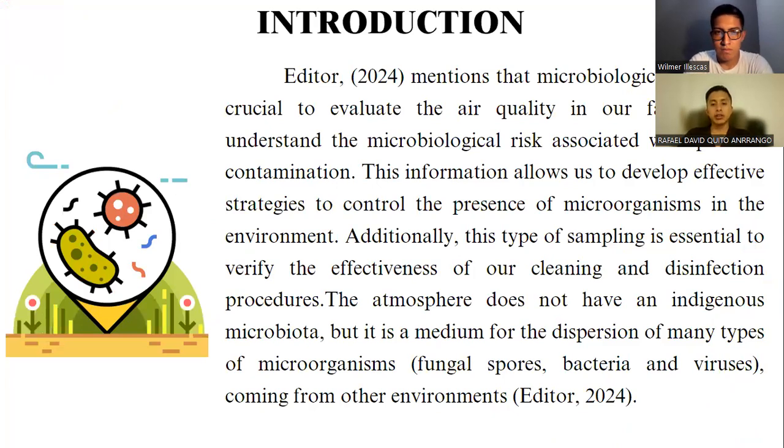In the introduction, Editor 2024 mentioned that microbiological analysis is crucial to evaluate the air quality in all facilities and understand the microbiological risk associated with possible contamination. This information allows us to develop effective strategies to control the presence of microorganisms in the environment.